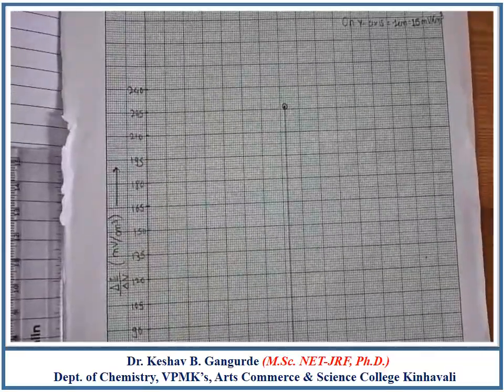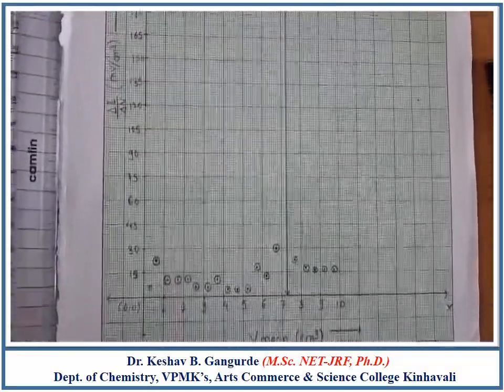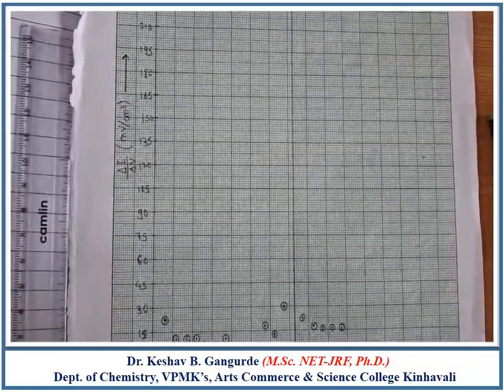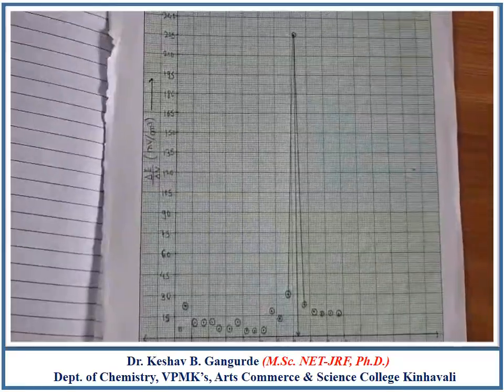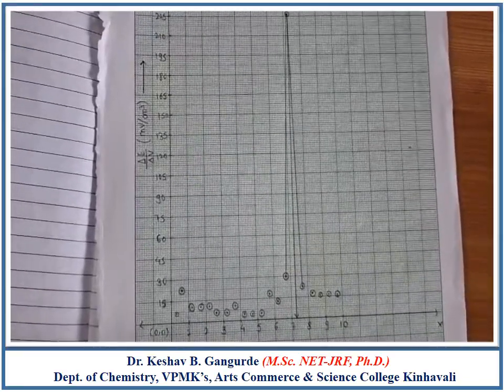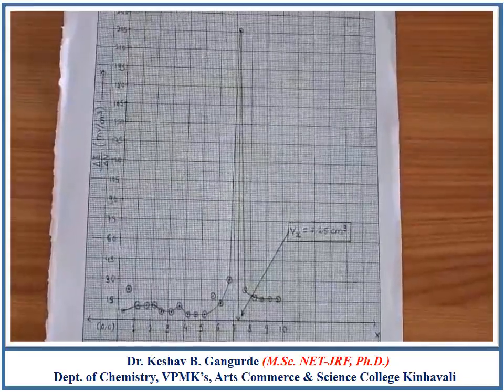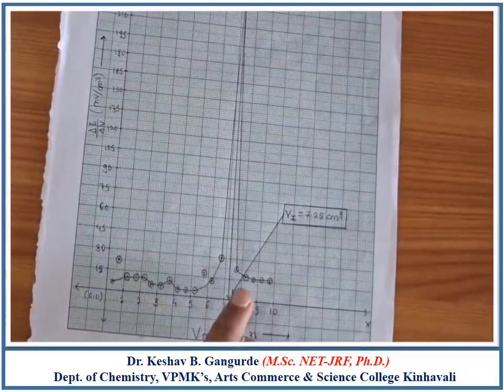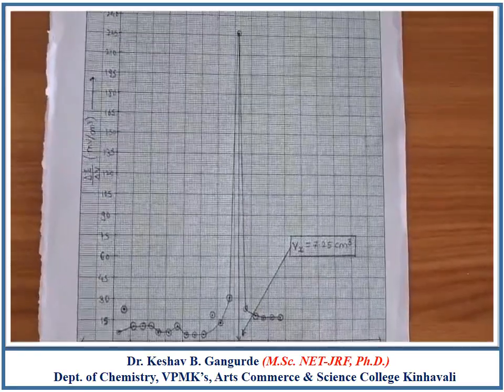From the highest delta E upon delta V point, draw the tangent in the direction of the x-axis and connect the points to the left hand side and right hand side of these tangents, and connect the remaining points by a smooth hand to get a peak with smooth curve. Find out the equivalence point of the titration, that is Vx equal to 7.25 centimeter cube.